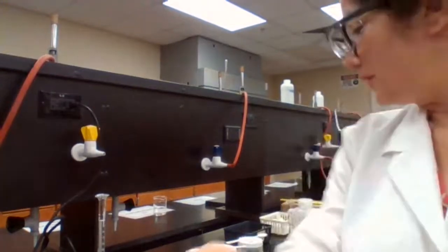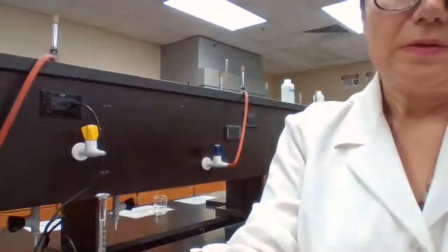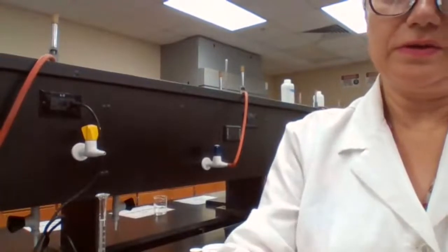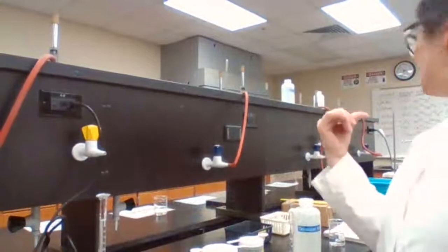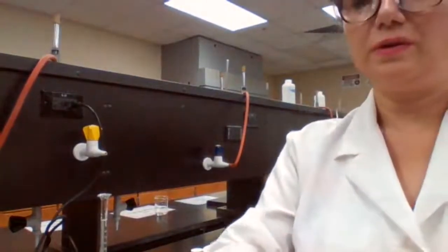47.855 minus 37.862, that's what we had before. This is going to be the mass for 10 milliliters of water.